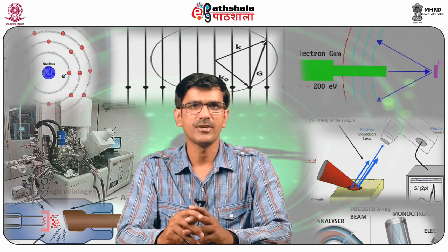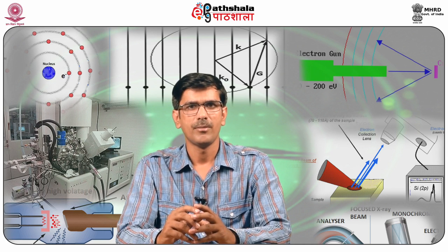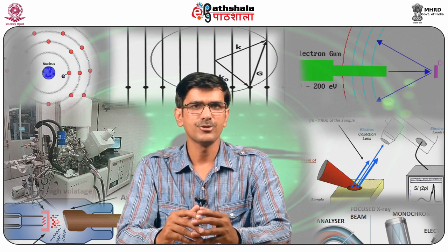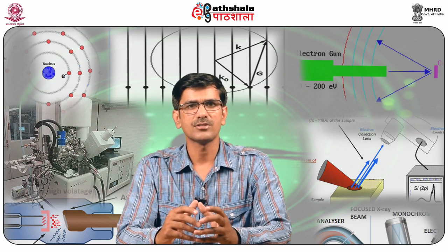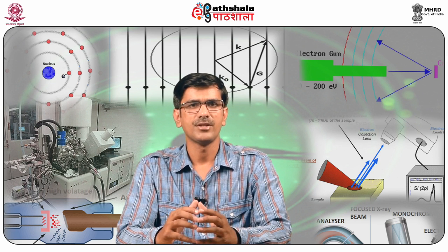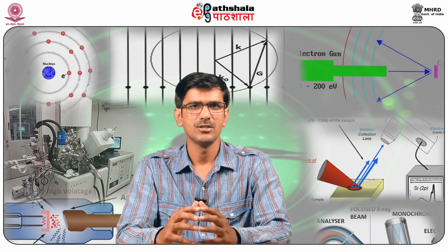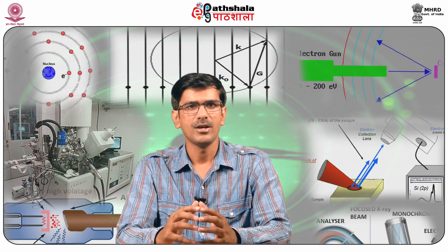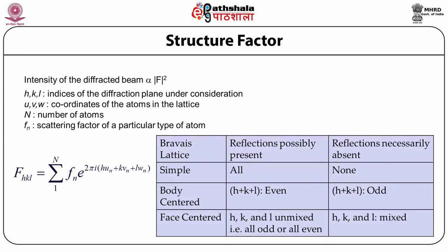The reciprocal lattice plays a fundamental role in most analytical studies of periodic structures, particularly in the theory of diffraction. In neutron and X-ray diffraction, due to the Laue conditions, the momentum difference between incoming and diffracted X-rays of a crystal is a reciprocal lattice vector. The diffraction pattern of a crystal can be used to determine the reciprocal vectors of the lattice. Using this process, one can infer the atomic arrangement of a crystal. The structure factor is a mathematical function describing the amplitude and the phase of the wave diffracted from crystal lattice planes characterized by Miller indices HKL.